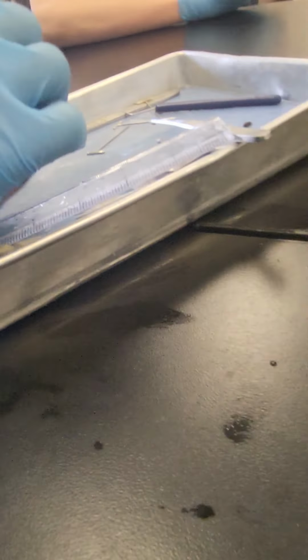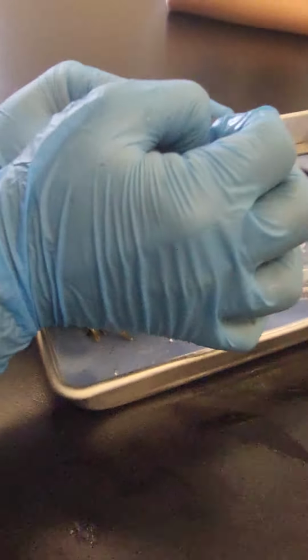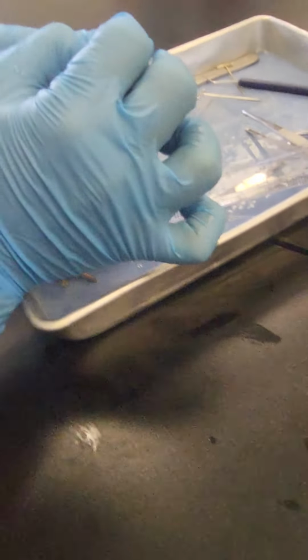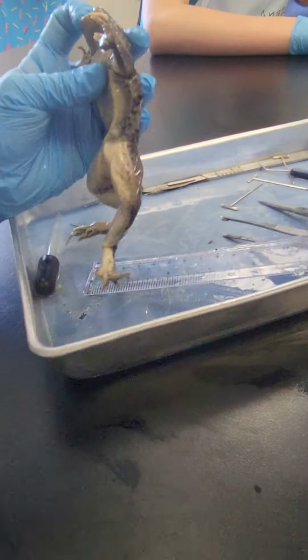It's a frog. Locate the tongue. Play with the tongue. No! Does it attach to the front or the back? No, cut it. Cut a little. Yeah, just like how she did in the video.